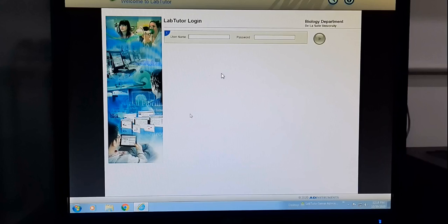You need to tweak the stimulation parameters in order to generate the output that you wish to demonstrate in the lab exercise. So sometimes it gets frustrating, especially when you're really not a tech person. You might end up with a result that is not what's expected in the exercise just because you failed to adjust one of the parameters. So if you're not really well versed with technology, this might be quite difficult for you. So the user needs to be very familiar with the LabChart software in order to use it efficiently.